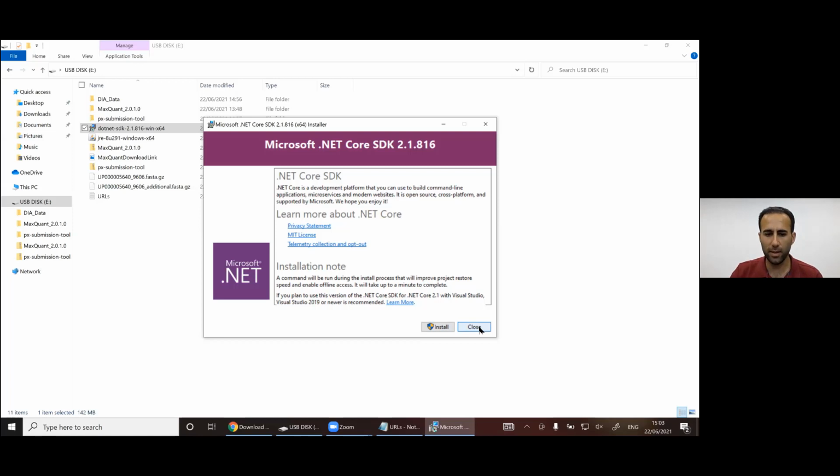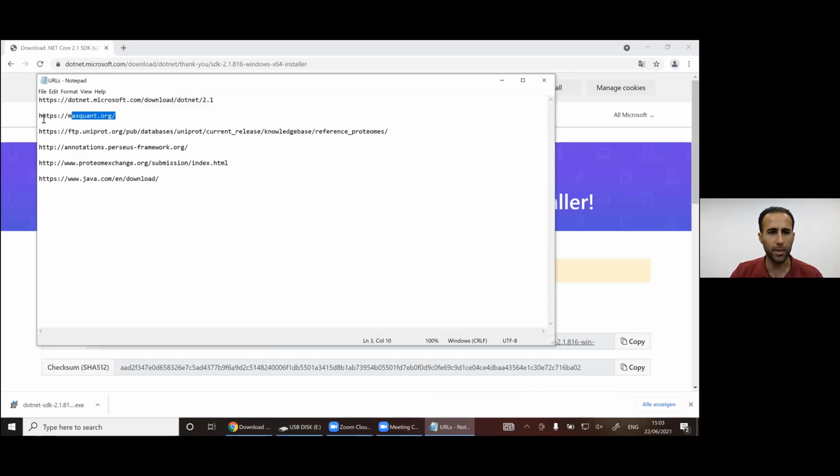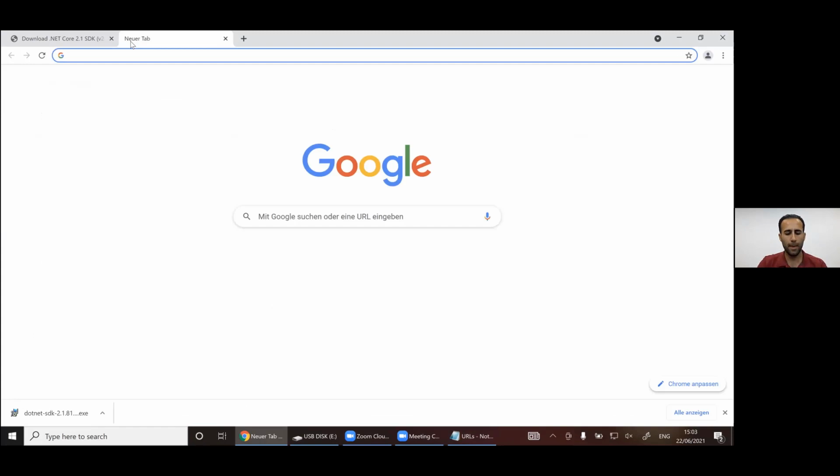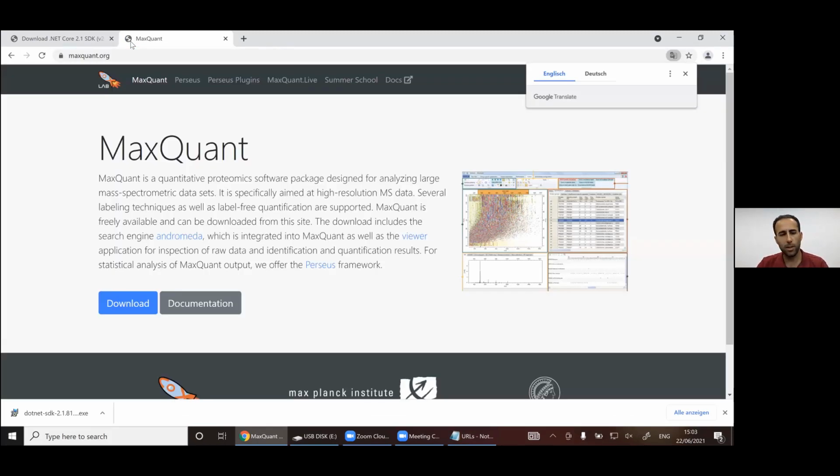After having done this, if it wasn't installed, you can go to our website, maxquant.org, right? The landing page, the home page here, is MaxQuant. Obviously, we have Perseus, the plugins, MaxQuant Live, and also our summer school page and documentation.